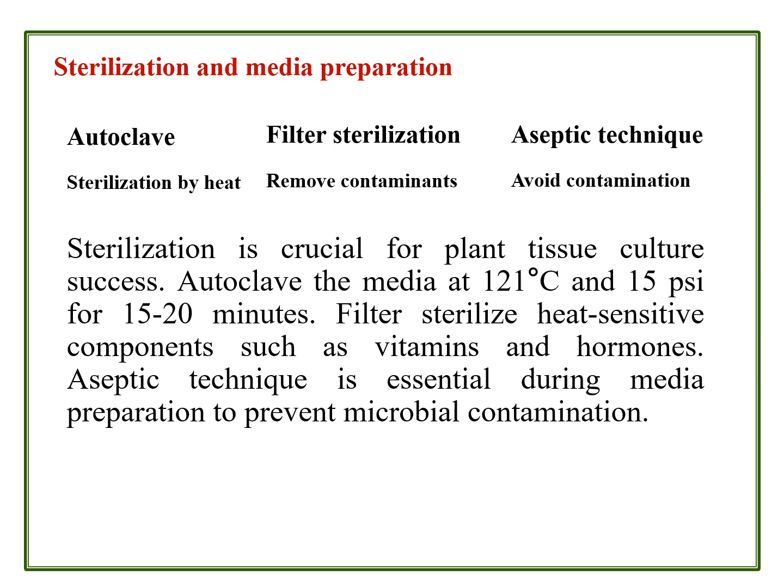In an autoclave, the working principle is that the boiling point of water rises, and the water vapor inside the steel jacket, or simply a kitchen pressure cooker, builds up. The raised water vapor pressure inside the stainless steel jacket hits the surfaces of the articles placed inside an autoclave or a pressure cooker. So the surface is completely free from bacterial or fungal contamination.